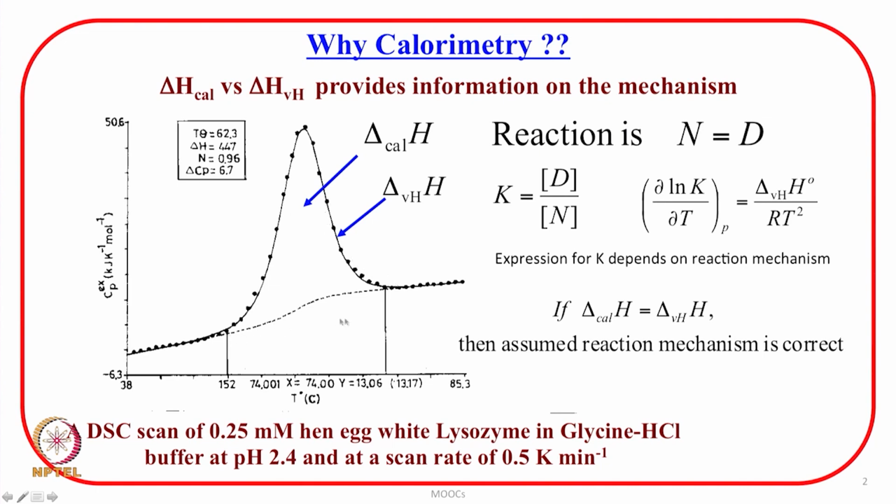If the transition is very sharp, then it will come like a spike, because generally at phase transitions, all the heat which is supplied is used up to bring about the phase transition rather than changing the temperature, and heat capacity becomes infinite. But since here we are talking about the protein system, in which this transition from folded to unfolded state is not like a solid liquid kind of phase transition, that is why it is not very sharp.